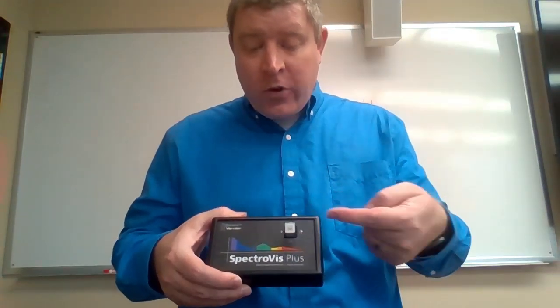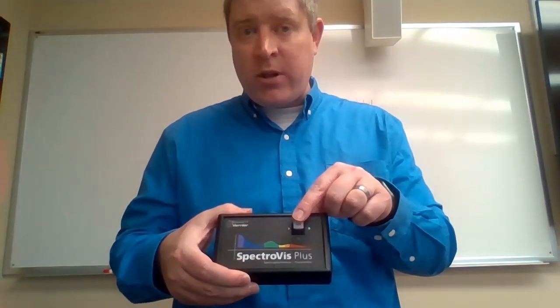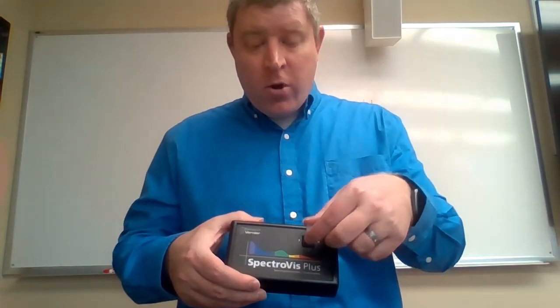When we have the cuvette in place, light is going to pass through the cuvette. Some amount of it is going to be scattered off of the cuvette. And we need to know how much light is striking the detector when we don't have any of our sample in place, and then how much light strikes the sample with our sample in place. So we need to collect what's called a blank. So you're going to fill the cuvette with a solution that is as close to the sample as we can get it without actually having any of our analyte, the compound that we want to analyze, in the solution.